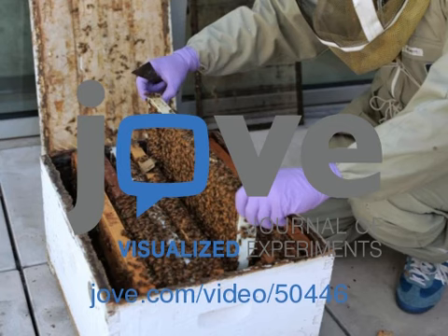Six days after the injections, collect treated bees from the colony without using a smoker to open the hive. Smoke is not used because it could affect the gustatory perception of bees, which will be tested in this procedure. Collect bees in metal mesh cylinder cages using soft forceps with no more than 3 bees per cage.